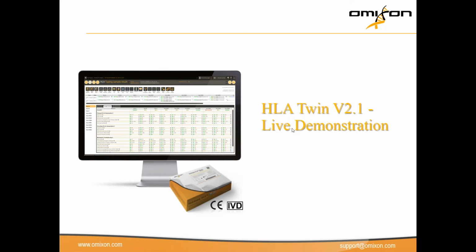So there is another question here. In addition to Beckman, do you have solutions for automation using other liquid handlers from other vendors, such as the Tecan? I believe this is a question for Marcello. Yes, I mean, Omixon can also support the Hamilton Star, the Agilent Bravo, the TPG, the Robot DXA from Texas Biogene, QIAgility by QIAGEN, and the Janus by PerkinElmer.